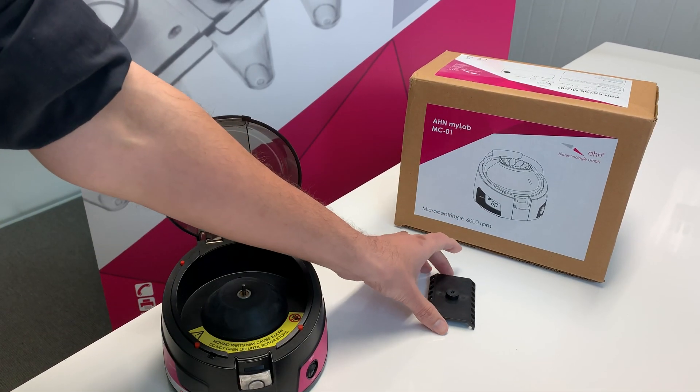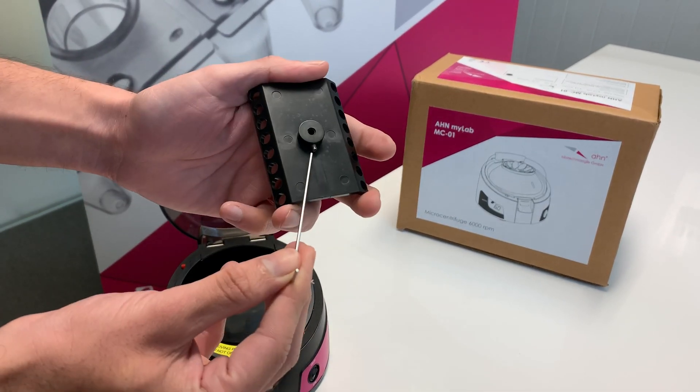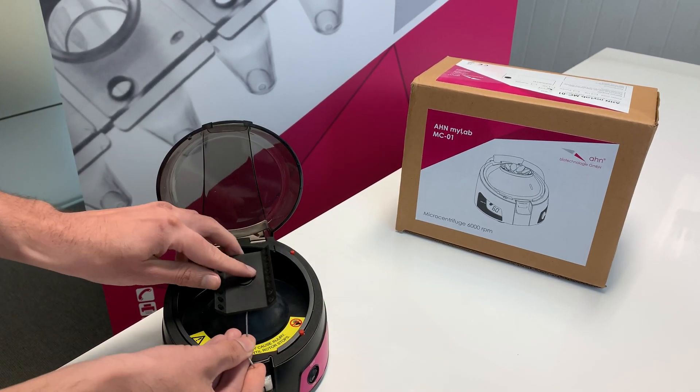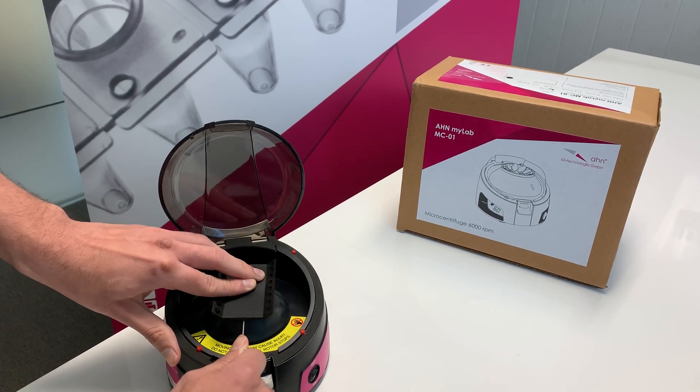If we wanted to change it to a PCR rotor, which is available in the box — here is the screw for the PCR rotor. Fix it inside, aligned with the shaft, and then simply screw it in.